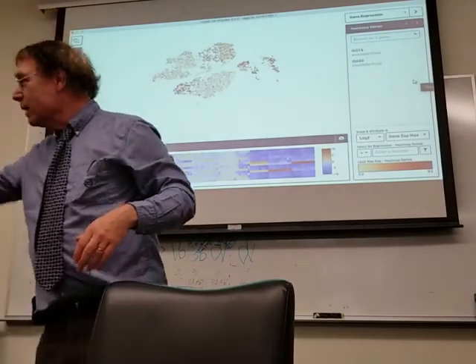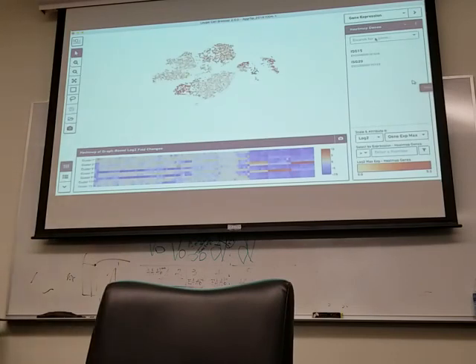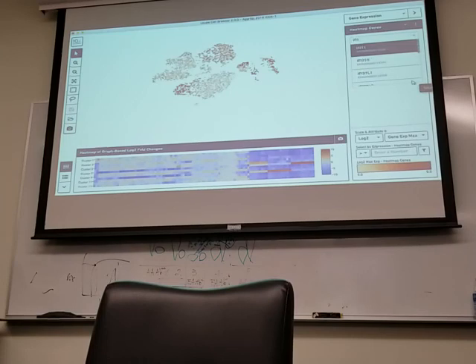And then IFITM1. Yeah, IFITM1, not ISG, IFITM1. Right, IFITM1, yeah.